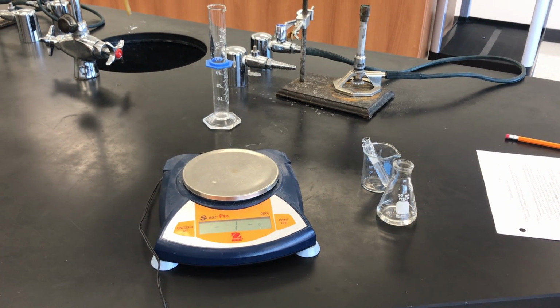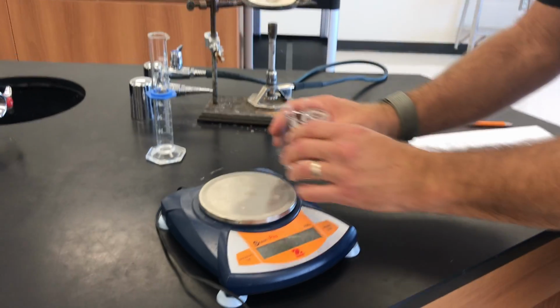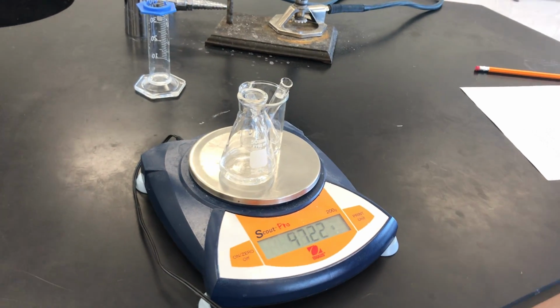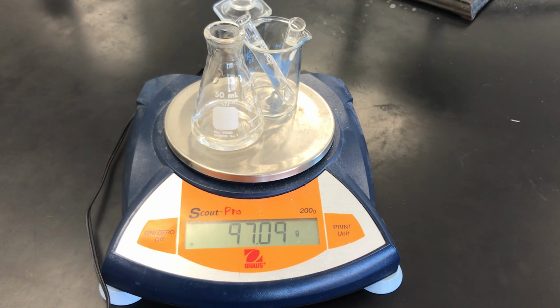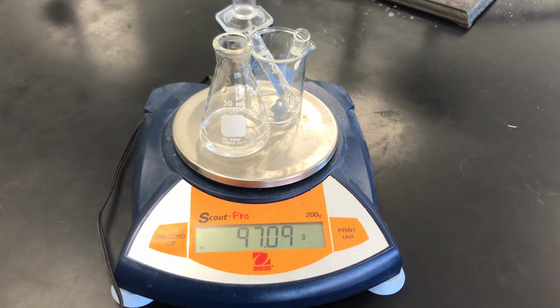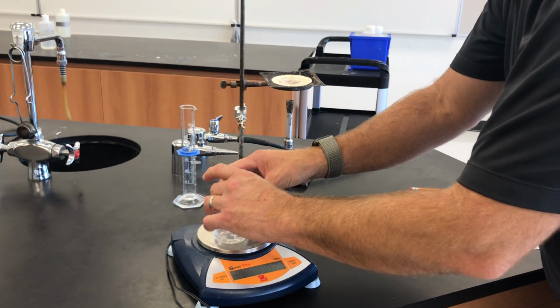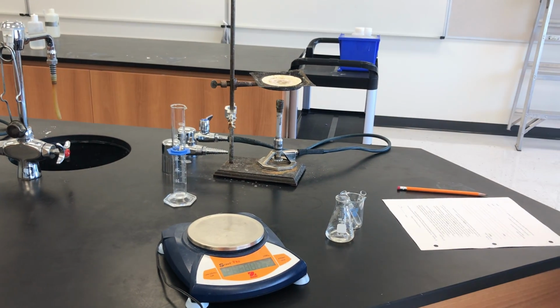And at this point, as it mentions in step number 4, we're going to re-zero, and then we are going to weigh all 4 pieces of glassware. Please be sure, as it says in step 4, to record this mass in your quantitative data. Now at this point, we're going to start doing the chemistry of the lab.